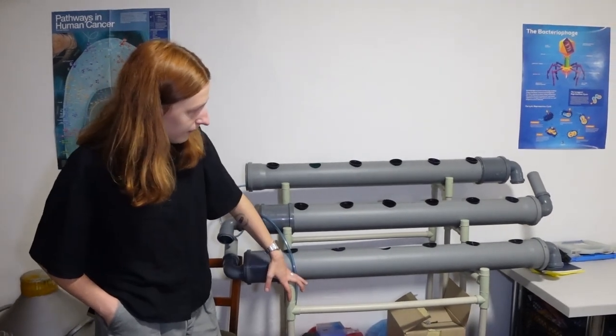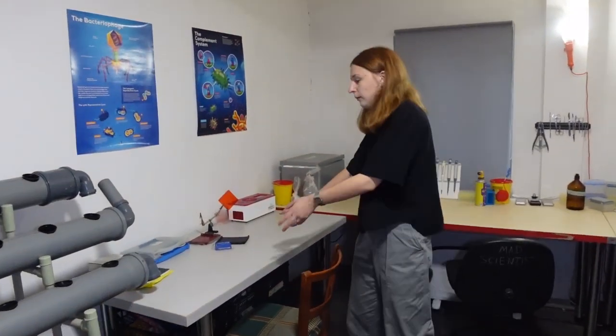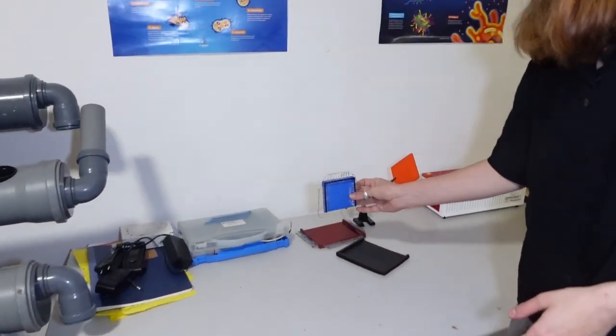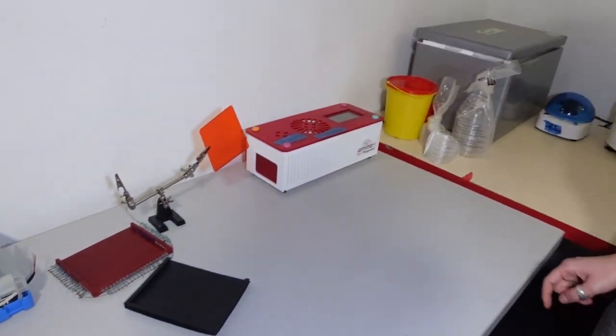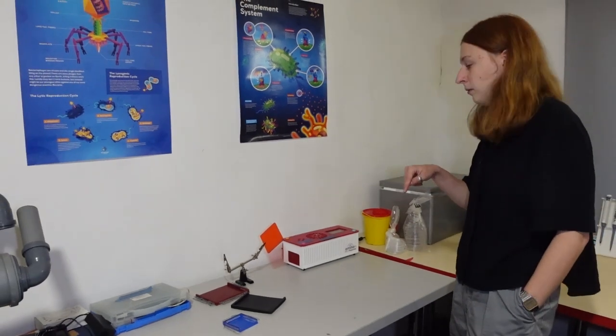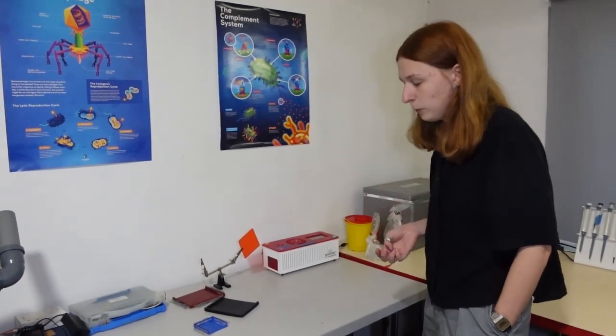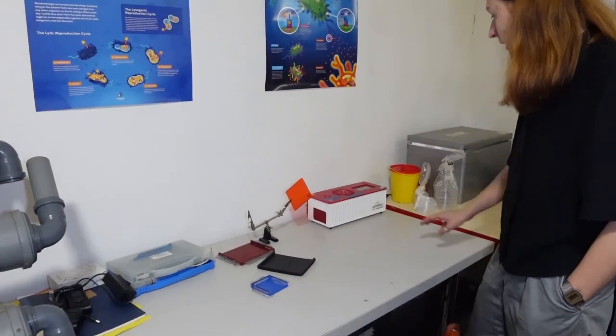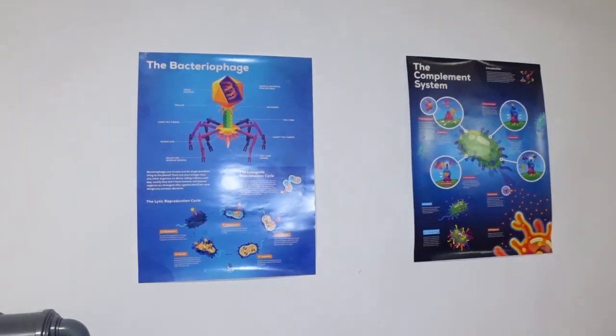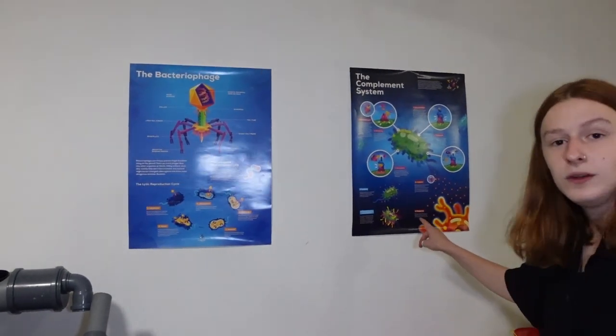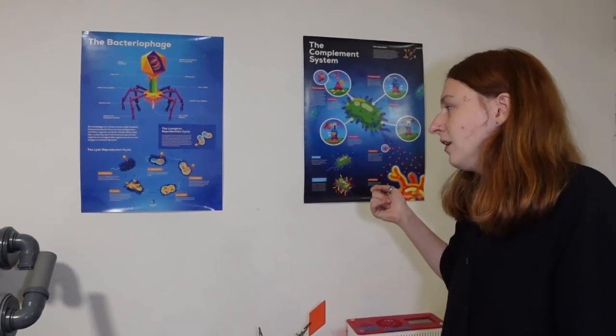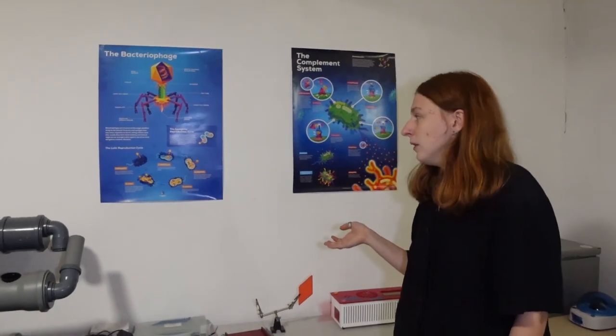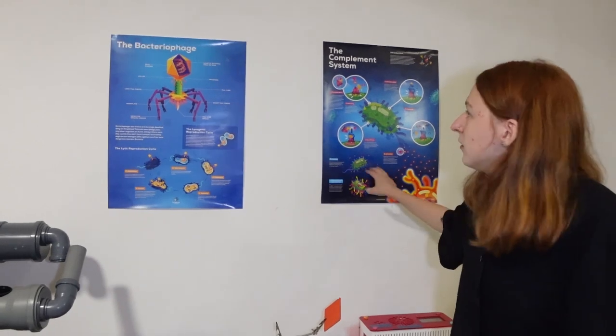Now we're going to enter the main lab area where we actually work. I have these tables, here I'm mostly soldering, working on equipment, working on a gel electrophoresis imager, making a few of them. I'm using Sebastian Kochiobus protocols. I also have some posters, they're from Kurzgesagt. I actually stole these posters from The Odin because people just keep sending stuff to The Odin lab and when I was there in Austin I stole them because they can't keep it all. Bacteria phage and complement system.